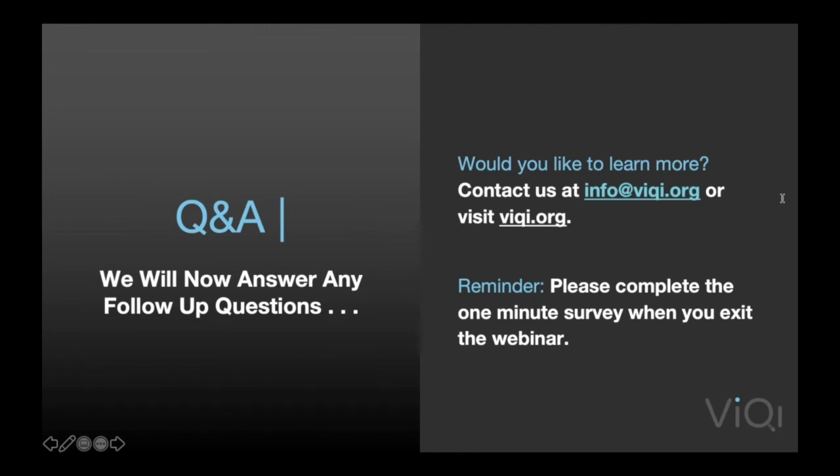That's just UI based, so there's no programming to do. In terms of deep learning, the reason I didn't identify individual software for this audience is because there really isn't sort of push button AI that uses deep learning. I mean, we're developing that. I believe Ann Carpenter's group is working on that also. I think in the coming year or so, we'll start to see the initial attempts at this, but it's a lot trickier to put together deep learning AIs, but we're getting there.